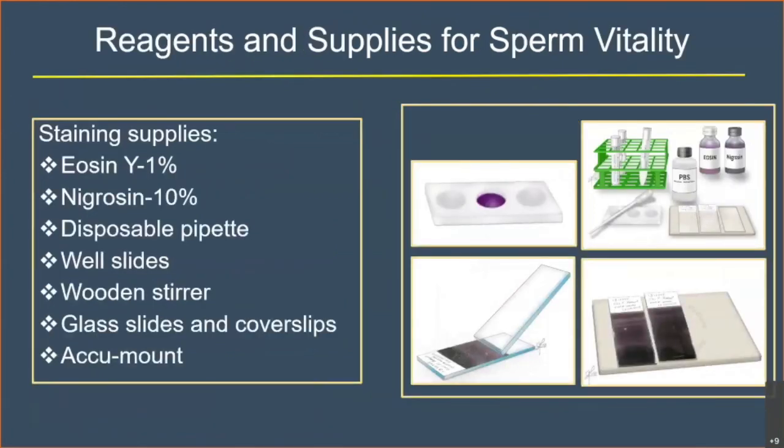This slide shows some of the staining supplies, and the image on the right shows a special porcelain slide, which is a 3-well slide. It's known as the Werner slide. Next slide, please.